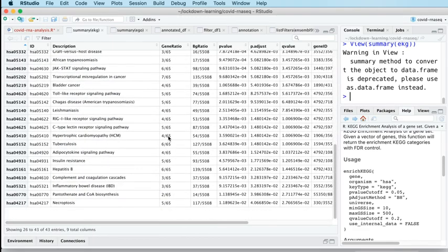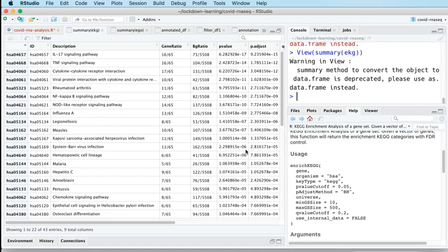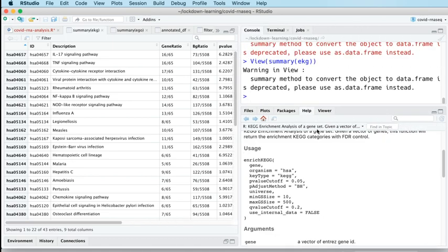Okay, so that's KEGG pathway enrichment as well. And again, there will be methods for seeing these pathways as well, and we can maybe explore that next week. Maybe I'll try and fix these visualizations, and we'll come back to that on Monday and do more visualizations.